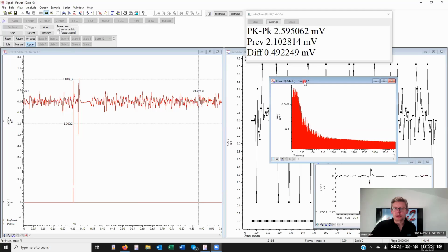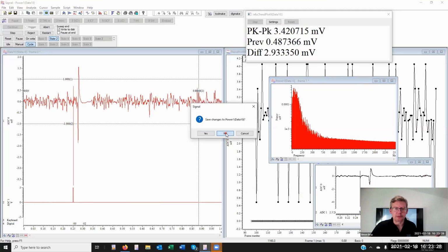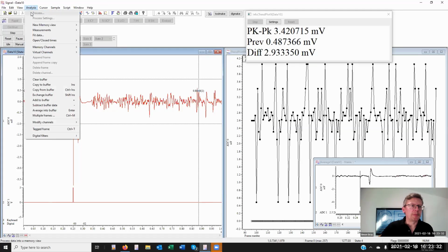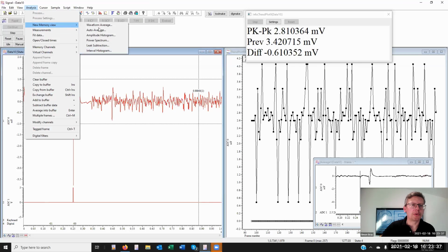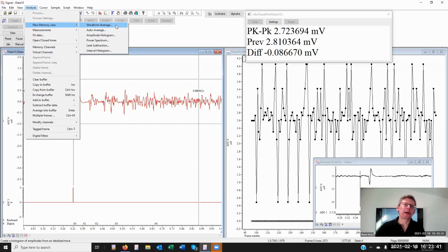So back to the analysis functions here. Remember the average and the power spectrum. I think we understand what's going on there. I don't think we need to see the power anymore. I'm going to ask Simon Parker, a colleague, to talk more about these memory views next week. So I just wanted to introduce you to the idea of a waveform average and a power spectra.